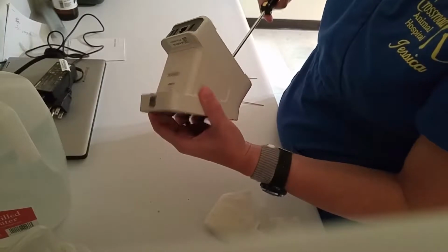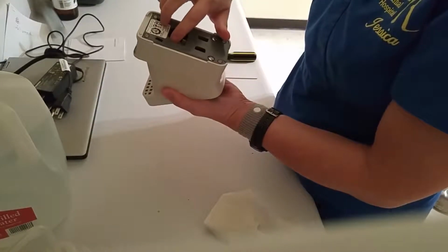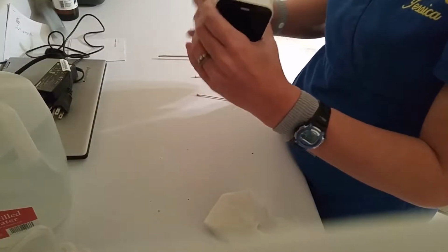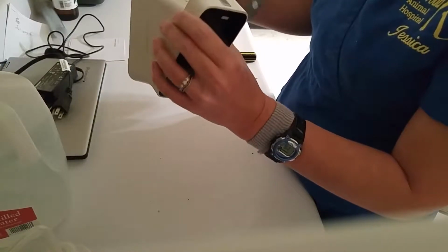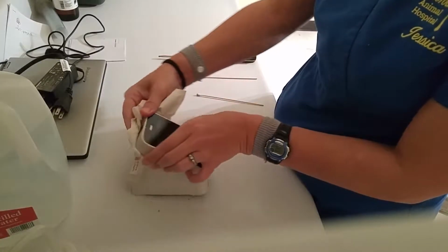And put it back together. Again, make sure that it moves freely here. We don't want anything to be in the way. We want to make sure that everything is clean here. Some dust back here. We don't want that to get into any of the plug-in areas. So go ahead and clean this off.